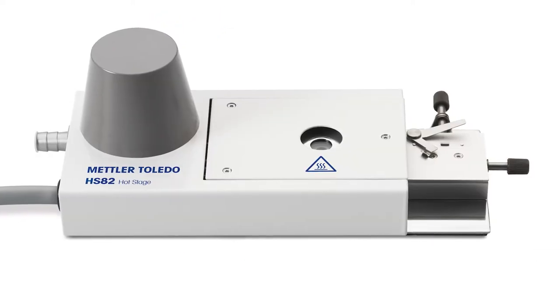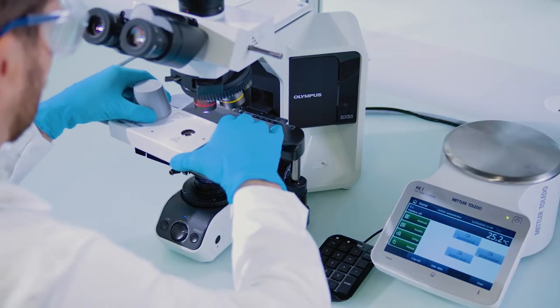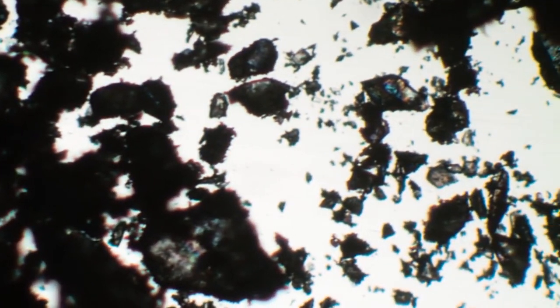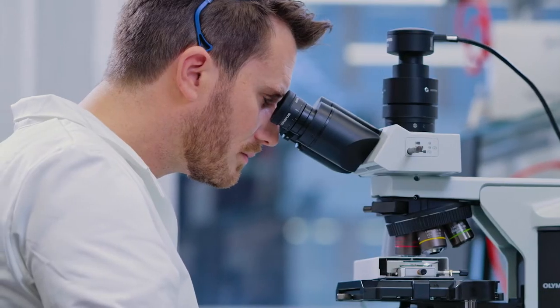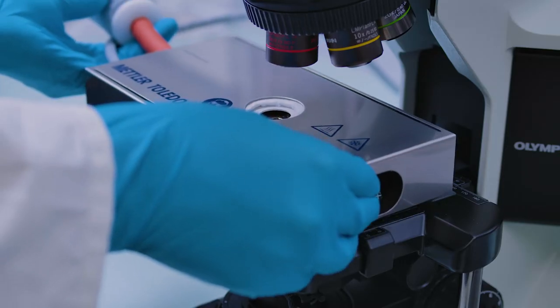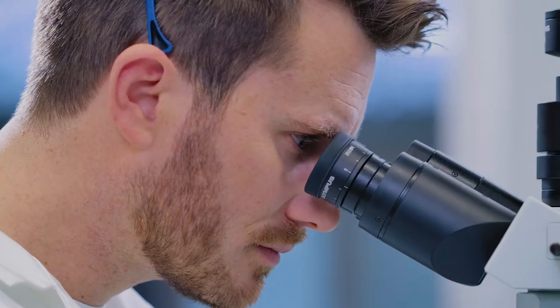With our hot stage system HS82 you can focus on different areas of the sample by moving it using the built-in XY table. Heat or cool the sample while observing it under the microscope. The optional cooling box enables operation at sub-ambient temperatures.